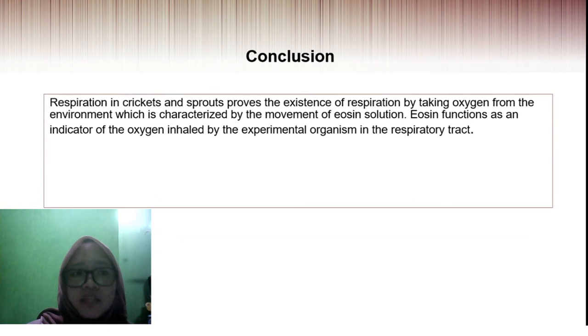Conclusion: respiration in cricket and sprouts proves the existence of respiration by taking oxygen from the environment, which is characterized by the movement of eosin solution. Eosin functions as an indicator of the oxygen inhaled by the experimental organism in the respiratory tract.